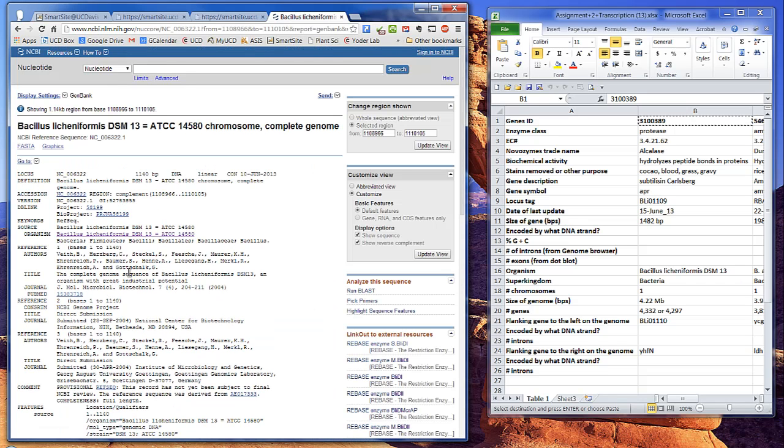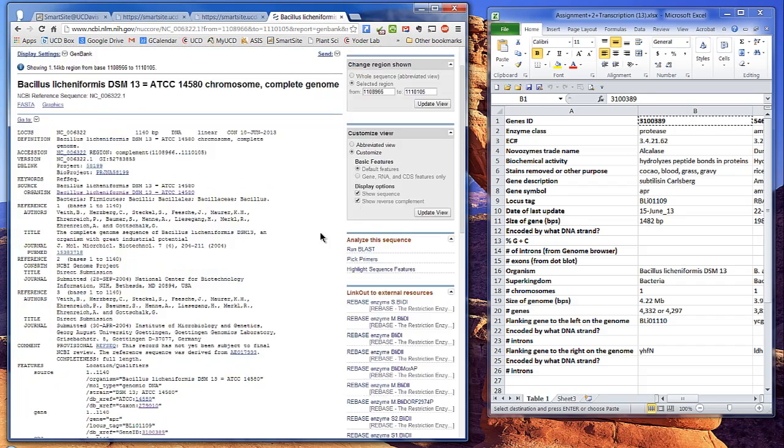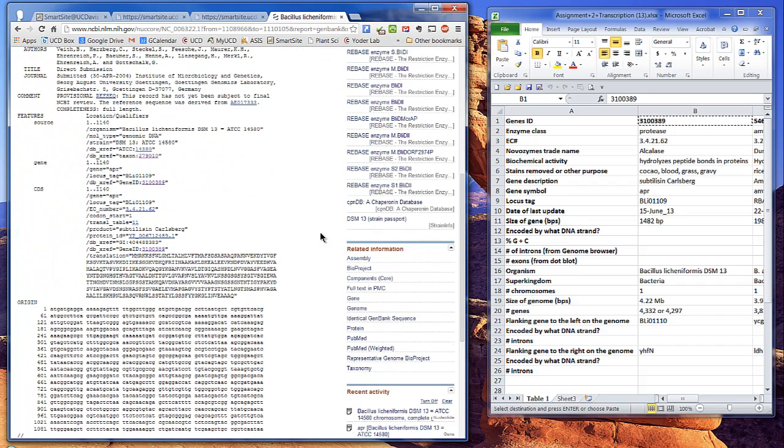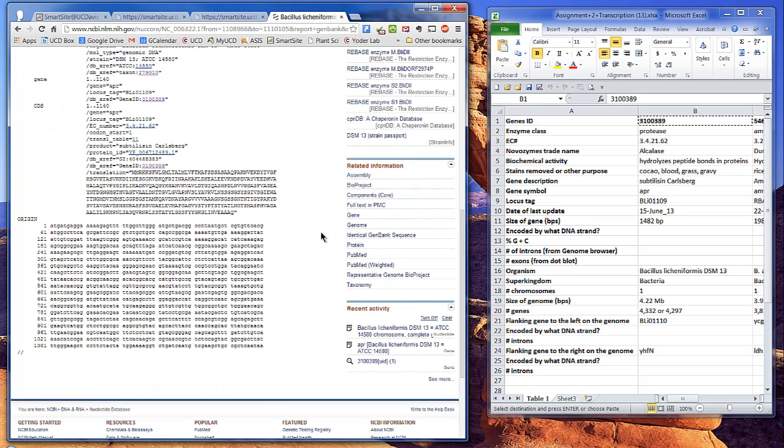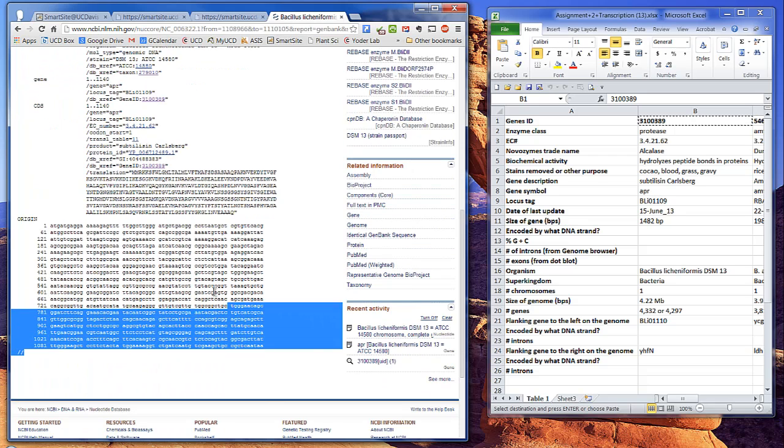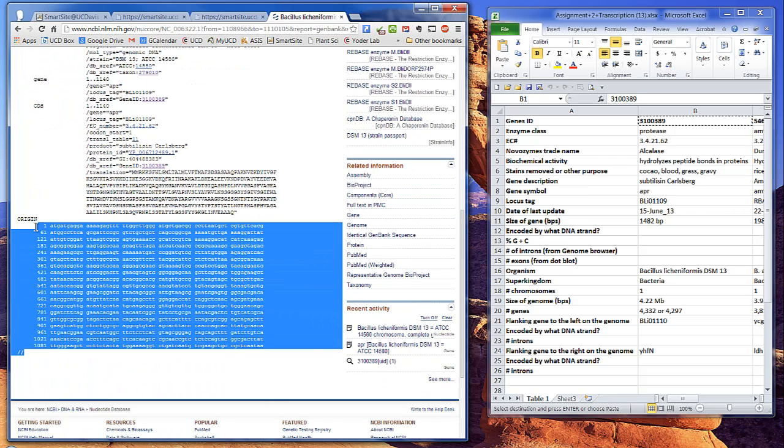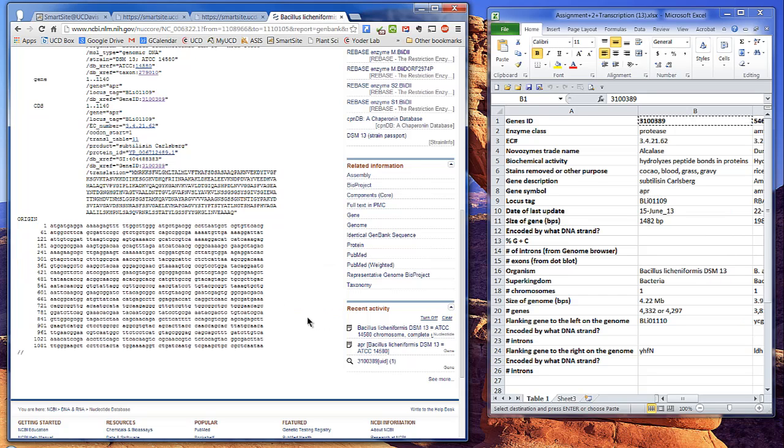GenBank is a format that gives you lots of information about a gene, including the references, some annotations or description of what the gene is about, and the sequences. You can cut and paste these sequences, but the numbers to the left of each line cause problems with bioinformatics programs that expect a nucleotide sequence to be comprised of A, T, C, or G, and not numbers.